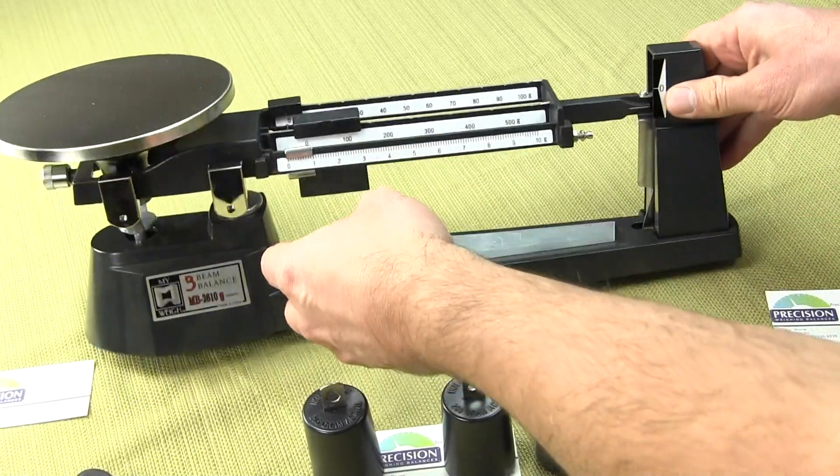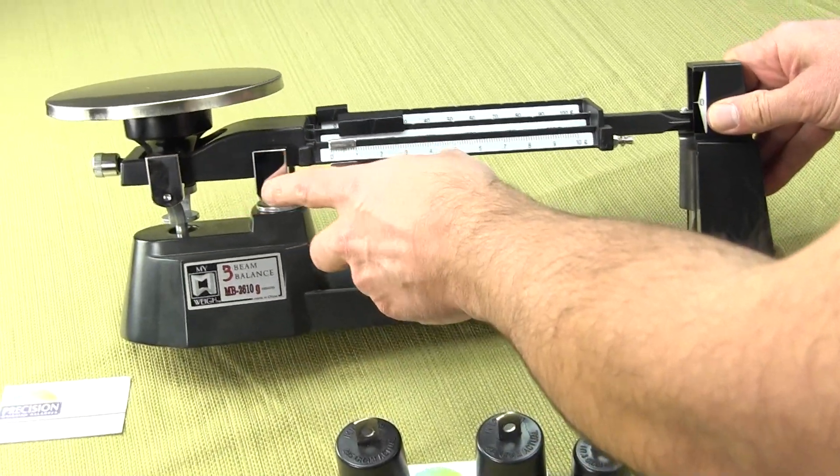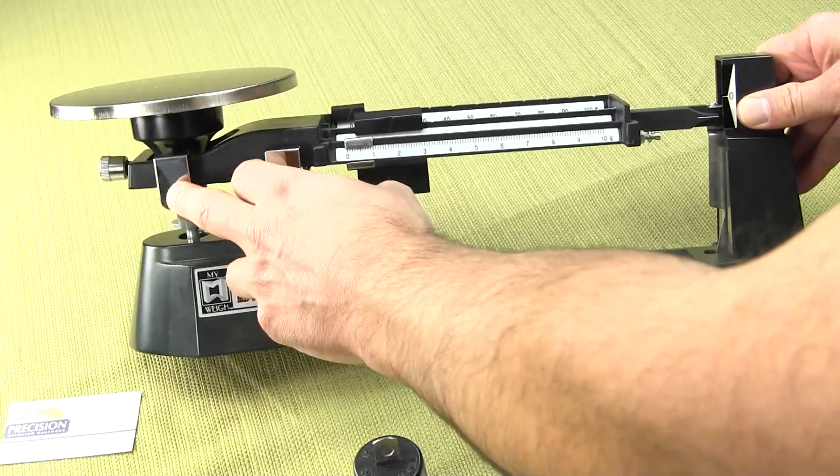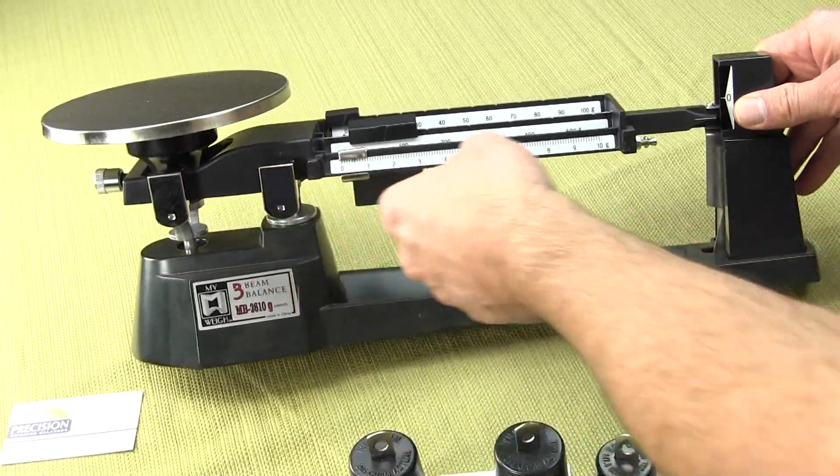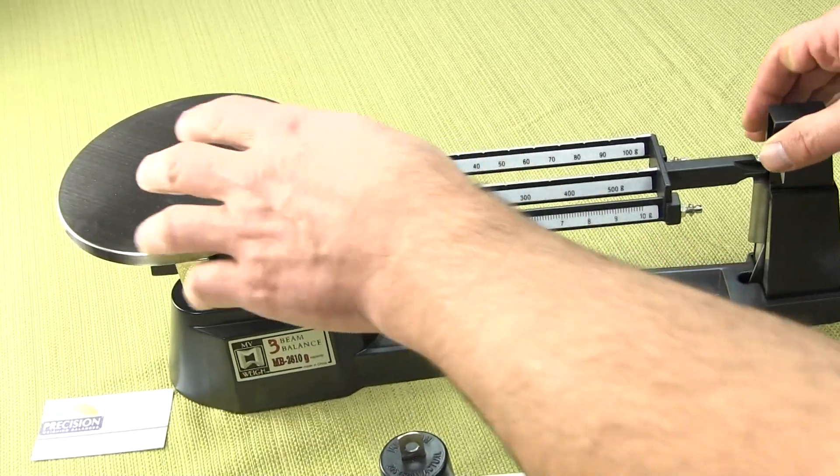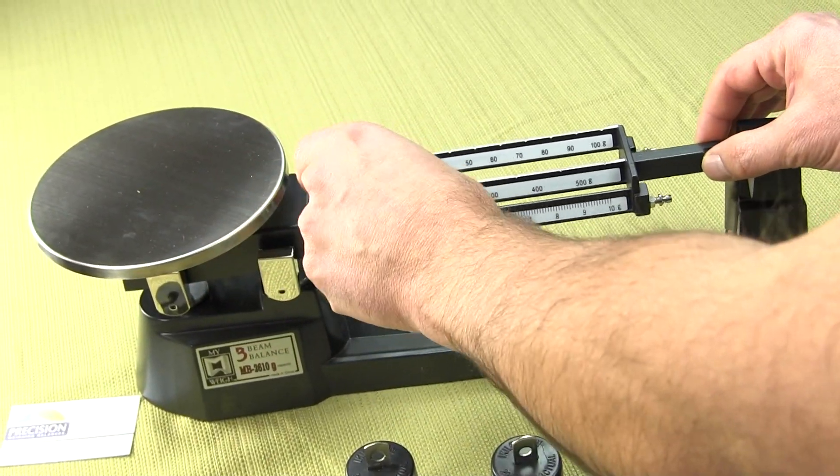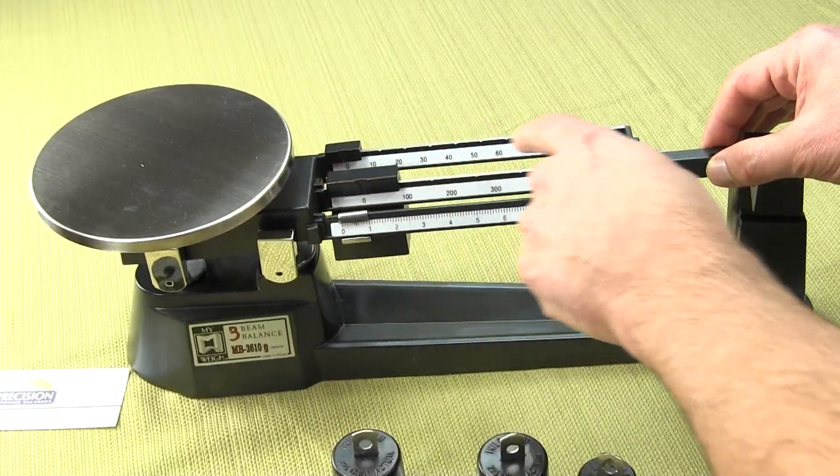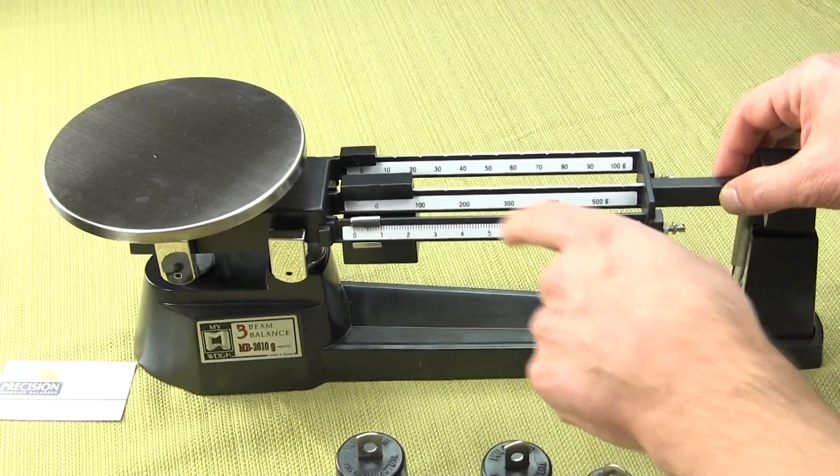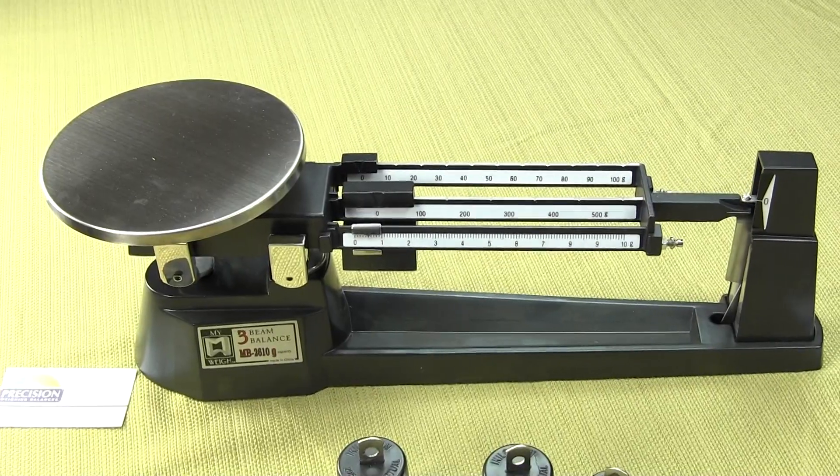The balance pivots on four agate bearings. There's two on this side and two on the other side. Just think of it like a seesaw. This is how the balance is working. You put a mass on one side and you adjust the riders to compensate for the weight. When it balances, that's the weight.